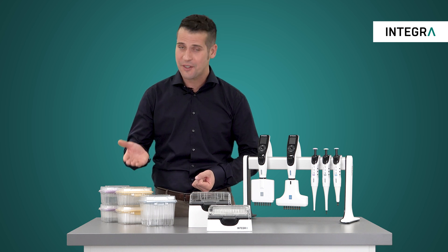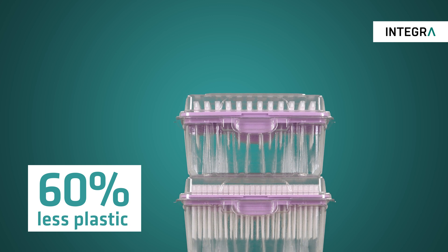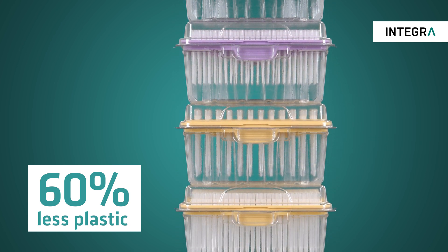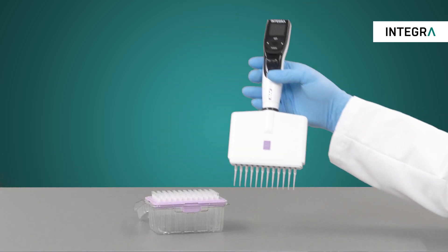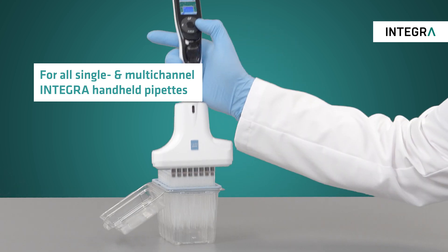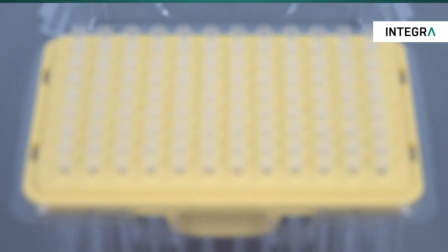Integra now offers Eco-Racks, which reduce plastic rack material by more than 60%. Eco-Racks contain the same high-quality Integra grip tips in an eco-friendly rack for use with all Integra handheld pipettes. These reduced plastic racks are designed to withstand tip loading forces from all Integra single and multi-channel handheld pipettes and are available in both 96 and 384 configurations.